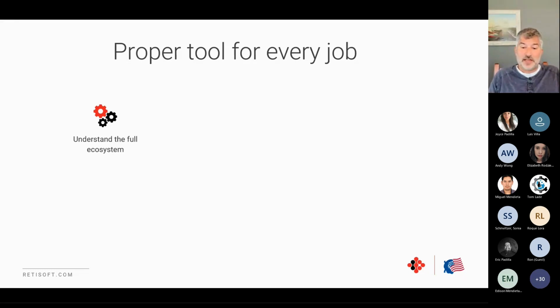Those handoffs often dictate how things happen in the lab as well. But again, it's just at this larger level, as we're looking at the entire LIMS ecosystem, we are still isolating tasks, but this time we're isolating large tasks. So inventory, reporting, process management, whatever. These are the large buckets that we want to select specific tools to accomplish.